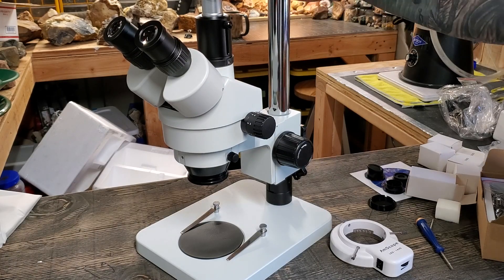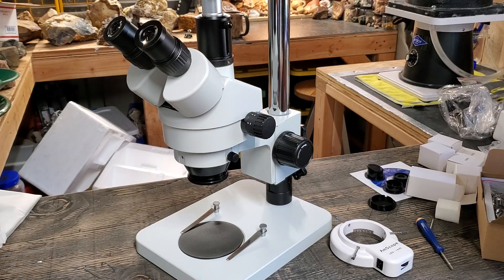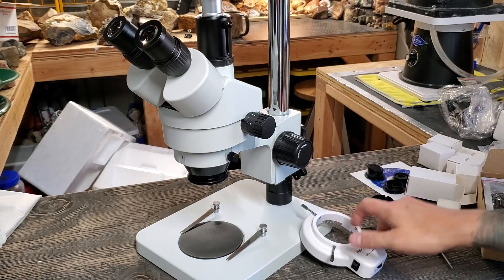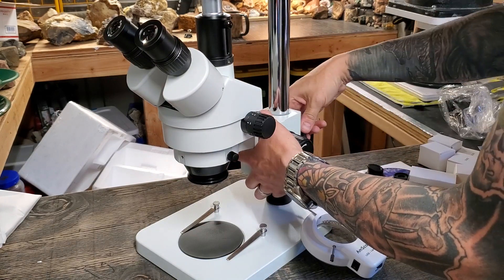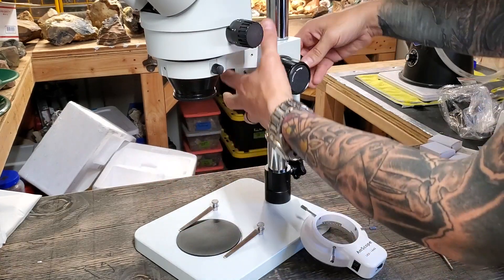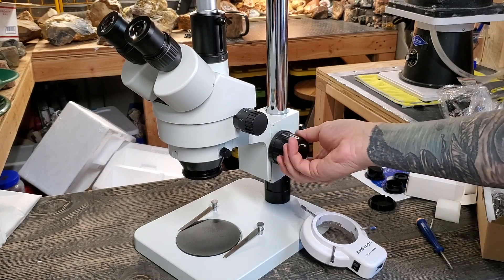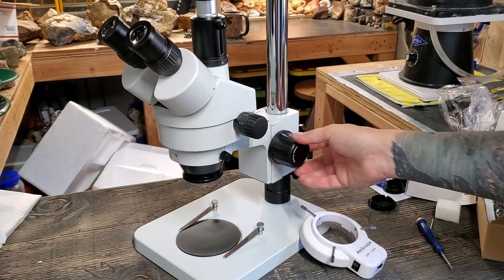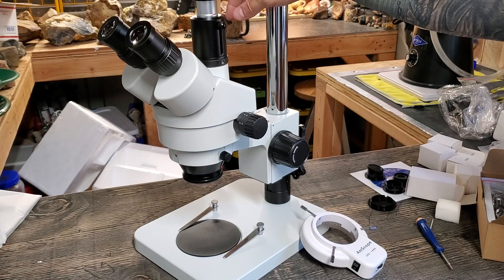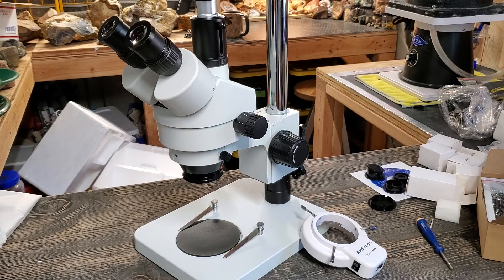This is going to be moved into the office where I have a little space set up. I'm gonna get this thing fully hooked up now — I'm super excited. This is awesome. I'll show you what it looks like fully up and running. There's a million little parts — we've got the camera, it comes with a light. This thing is perfect for rock and mineral identification because we can put a big sample under here if need be. I'm very pumped at the prospect of being able to figure out what some of this stuff is and share that with you. Let's move into the office now and get this thing up and running.